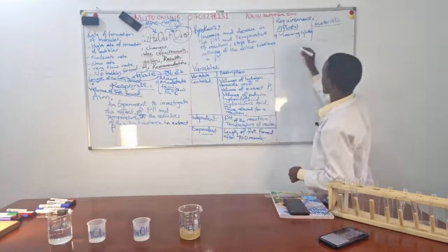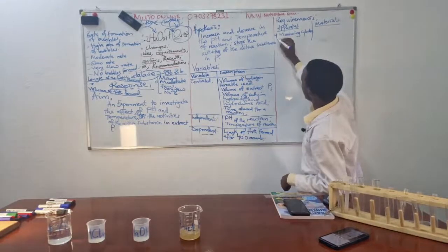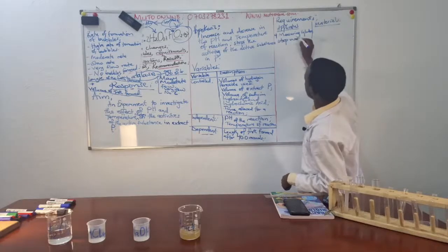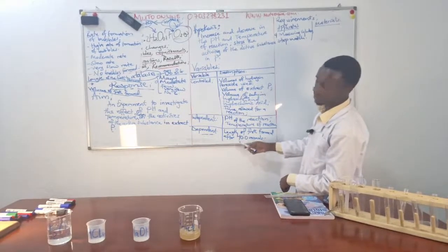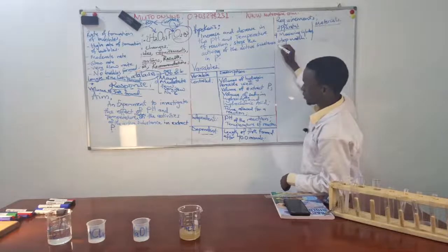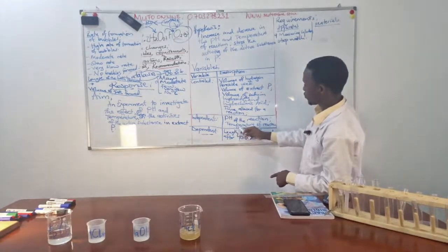I can have one and show clearly that I will clean after every use. I will need how many test tubes? Let me first take a timer. I will use a stopwatch because I have to determine time for the reaction. I've talked of the 40 seconds. I'm going to vary temperature.